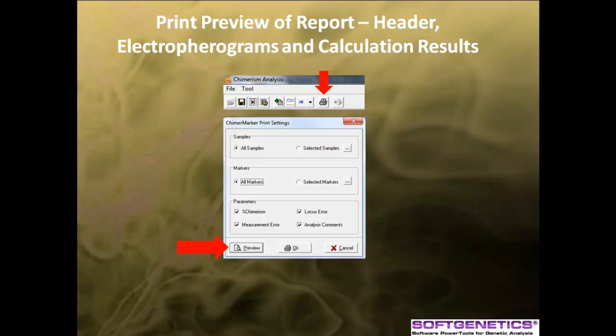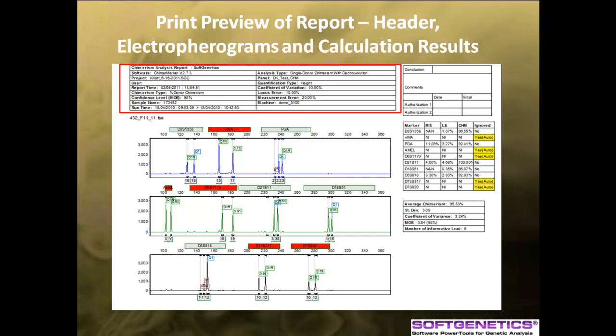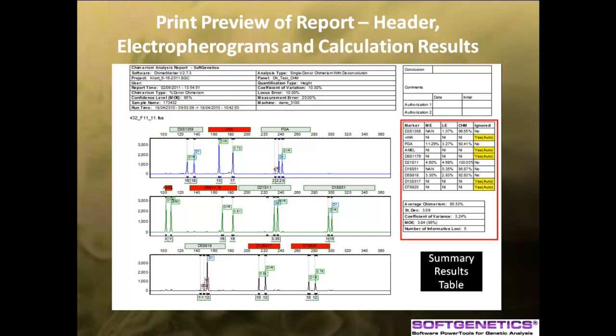Clicking the print icon will bring up a print settings dialog box. From here, you can choose specific samples or markers that you would like to print, as well as the parameters. Click on the print preview button to see a preview of the summary report. The header information at the top contains user management information as well as the parameters, time, and sample used for the analysis. The summary results table on the right includes all the results for each individual locus as well as the calculated average chimerism. The electropherogram identifies all peak origins for all dye colors present in the analysis.